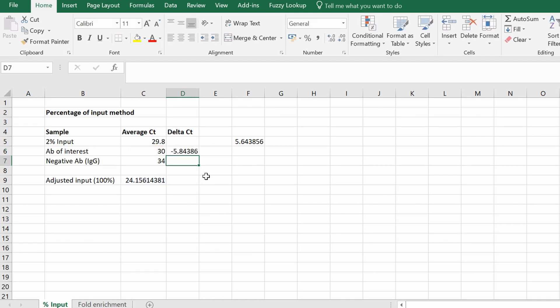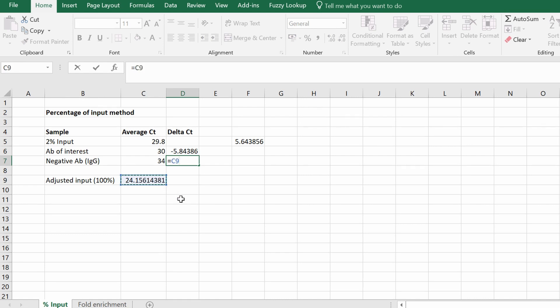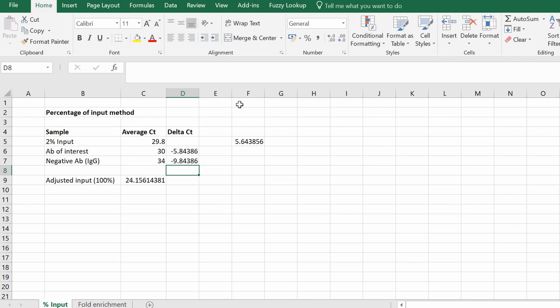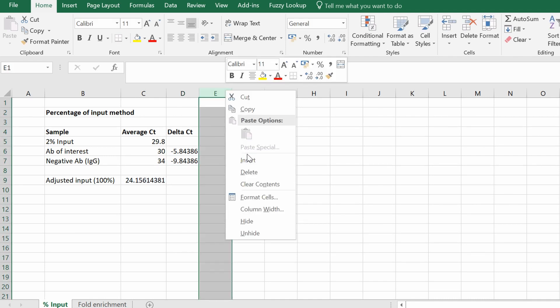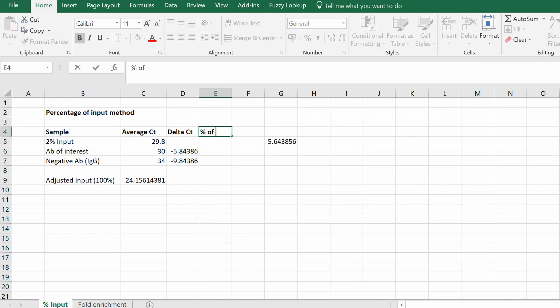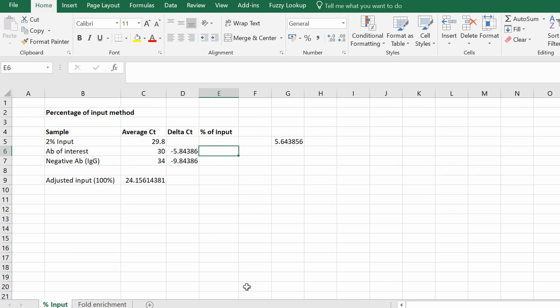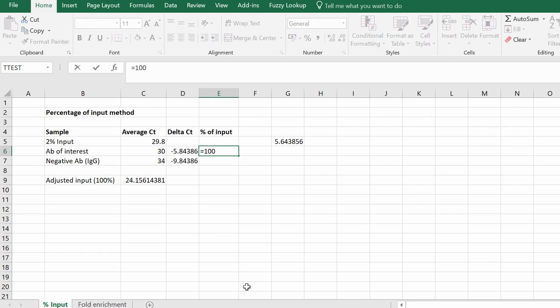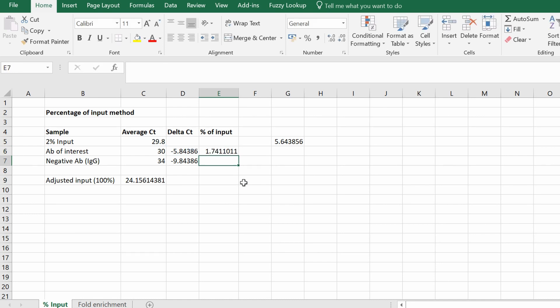Repeat this for any other samples you have. For the negative antibody sample, type equals the adjusted 100% input CT value minus the negative antibody CT value. Finally, we calculate the percentage of input. Insert another column called 'percentage of input'. The formula is: equals 100 multiplied by 2 to the power of the delta CT for that sample. Press return and repeat for all your samples.